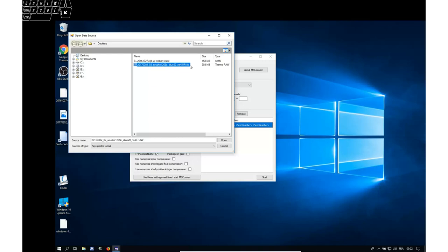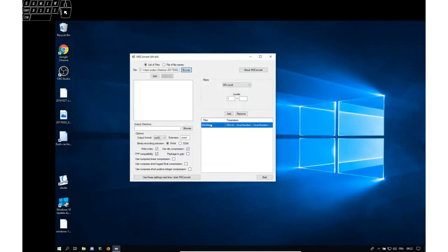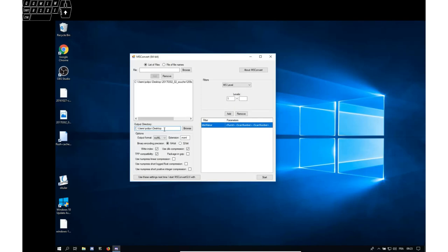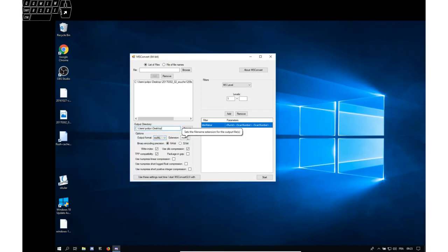You add the selected file to the list of files to convert. You select the output directory here. I will leave it at this location. The output format should be mzml and the extension I decided it would be mzml all lowercase. The binary encoding precision 64-bit, don't need to change this.